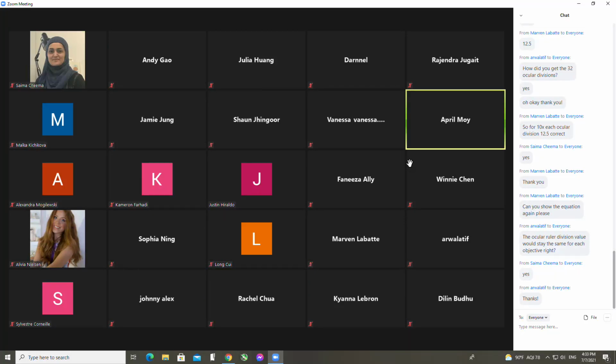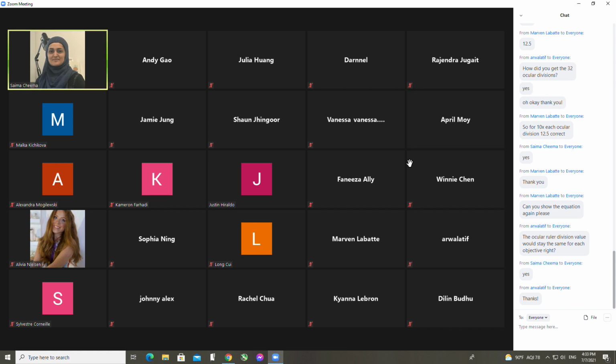I have a problem while measuring the pollen. When I get to the highest magnification, 100x, you don't see the whole thing, the ruler was too small to see the whole thing. So I stopped at 40x. Is that okay? Yeah, so you can say that. You can write that in the table itself, that it was too large to measure.